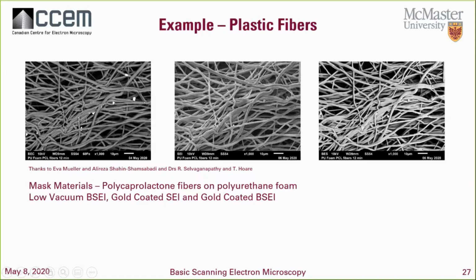So we've put on a very heavy metal. It's not very thick, it's nanometers, but it has obscured some of the detail we have when we're looking at average atomic number. So we have the carbon-oxygen-based polymer, and we have some particles of, in this case, potassium, probably hydroxide or carbonate on the surface here.